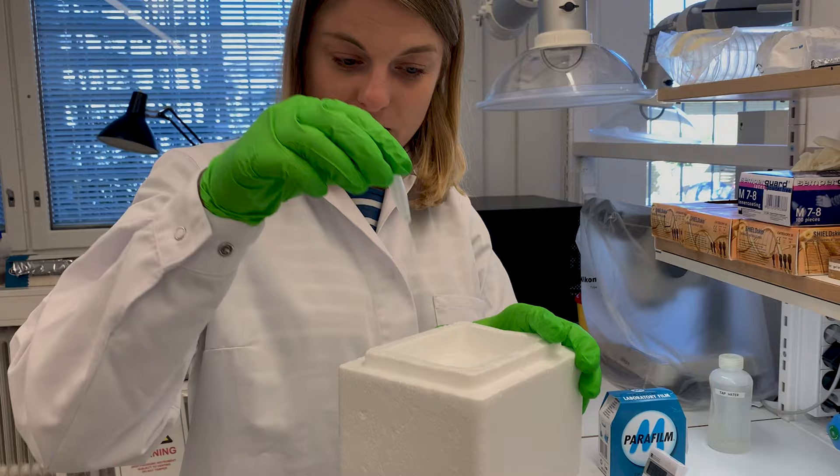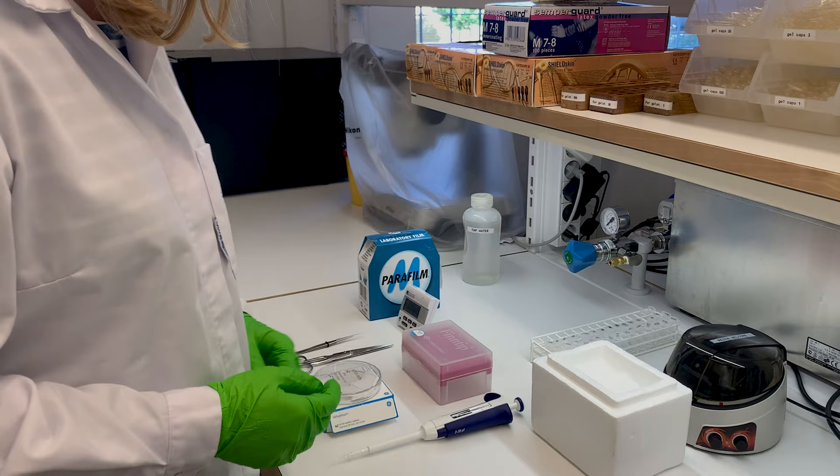First of all, the sample itself. We typically have quite small amounts that we keep safe on ice in most cases. We have an ice machine in the lab, so you're welcome to use that if necessary.